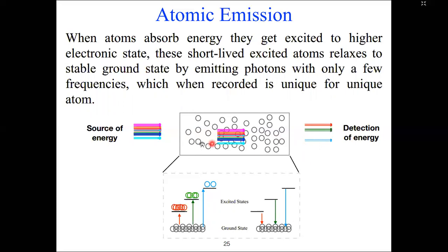So what happens in this compartment where the interaction between the atoms and the electromagnetic radiation occurs is, first, you have a bunch of atoms.